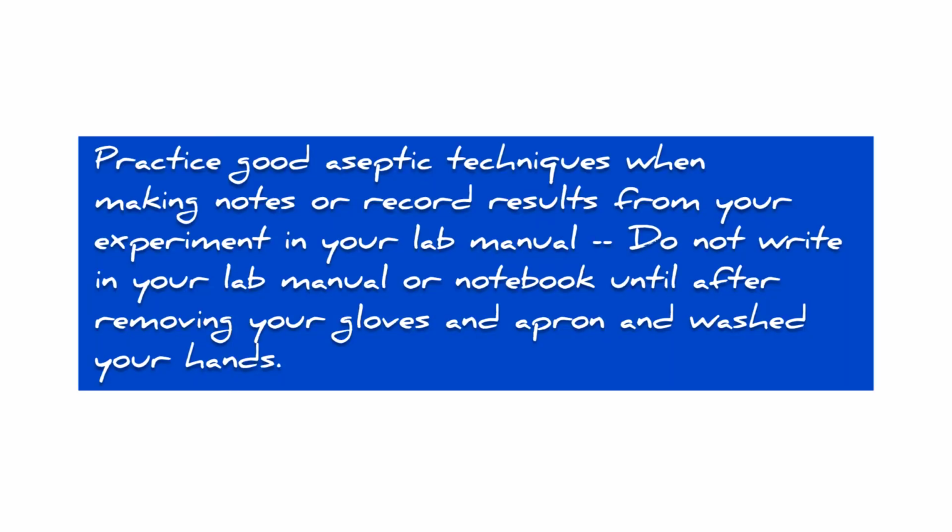Rule number 10. Practice good aseptic technique when making notes or recording results from your experiment in your lab manual. Do not write in your lab manual or notebook until after you have removed your gloves and apron and washed your hands.